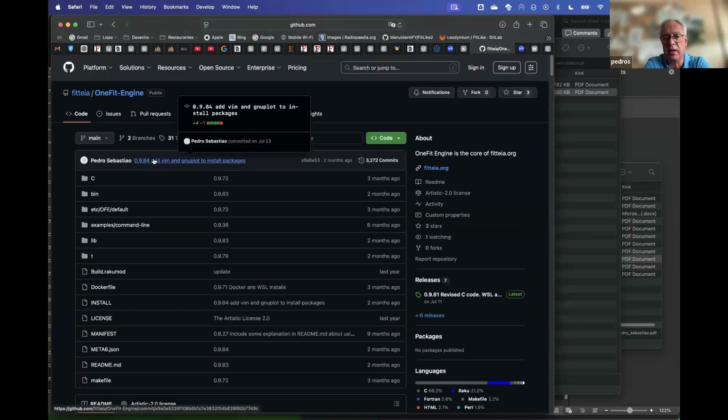Eduardo, I don't know if you are there. Sorry, I don't know if you gave a talk or not. Oh yeah, I already gave a talk 2 days ago. You gave a talk and you probably mentioned some of these things. Yeah, I mentioned the fact that in our software right now we are using the OneFit engine, that is this core engine that you provide, and it's nowadays integrated.